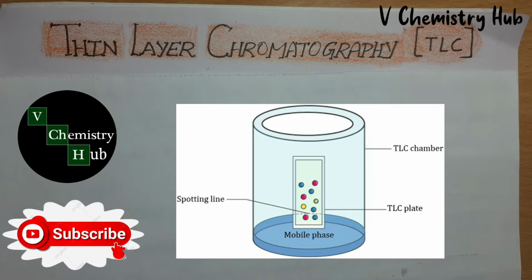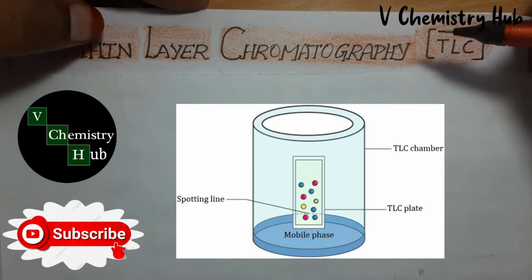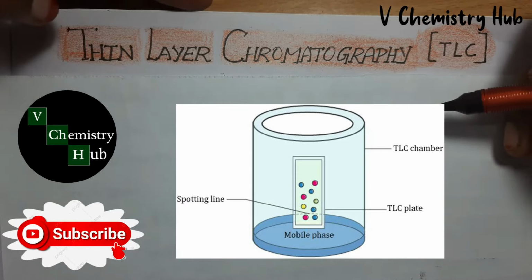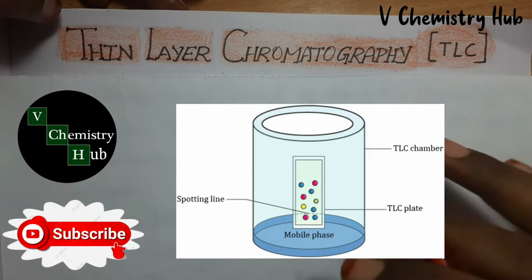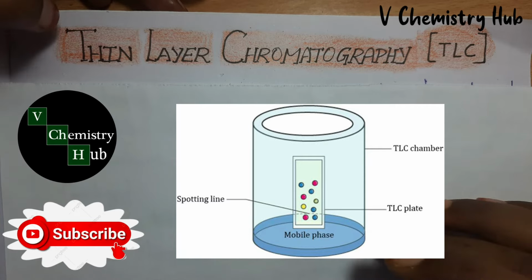In this video, I will talk about thin layer chromatography, applications, advantages and disadvantages of TLC. So please do watch the video completely for clear understanding. TLC is the basic type of chromatography and a little bit advanced version of paper chromatography. TLC works in a similar manner as paper chromatography. So, for understanding TLC, we need to know the basics of chromatography.